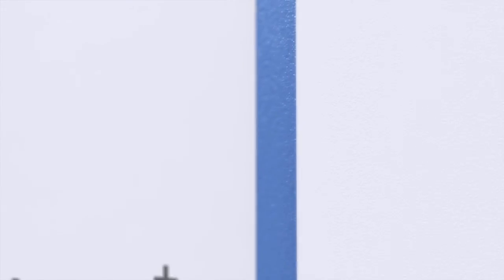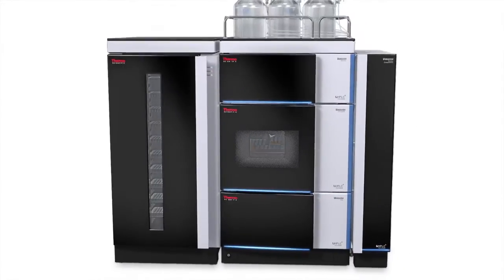The Vanquish system supports higher back pressure, better thermostating, optimized volumes, better linearity, and more sensitivity.